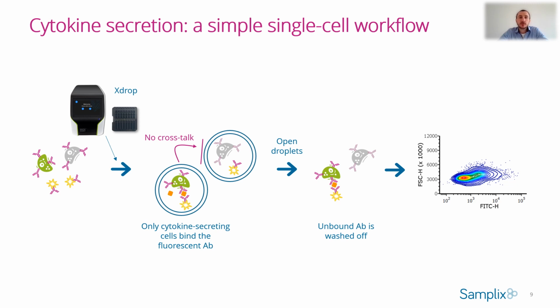And then after incubation time, you will break open the droplets. You will wash away the unbound antibody, and then we'll perform flow cytometry to look at the level of cytokine expression for the individual cells.